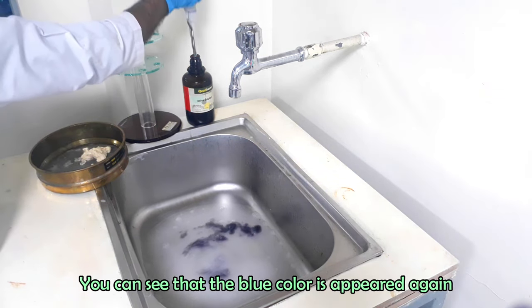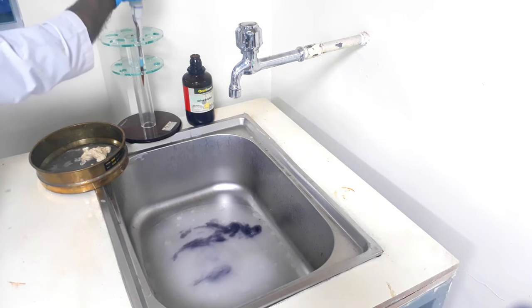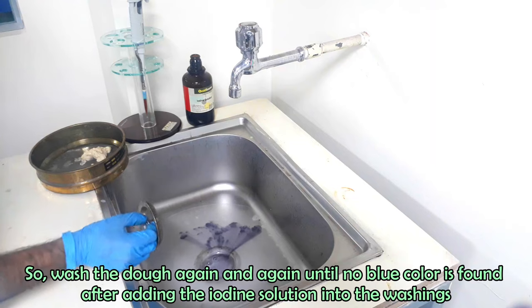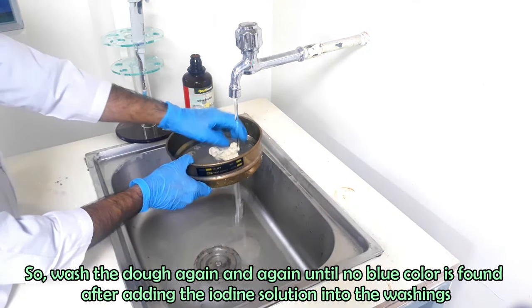You can see that the blue color is appeared when few drops of iodine solution is added. So wash the dough again and again until no blue color is found after adding the iodine solution into the washings.